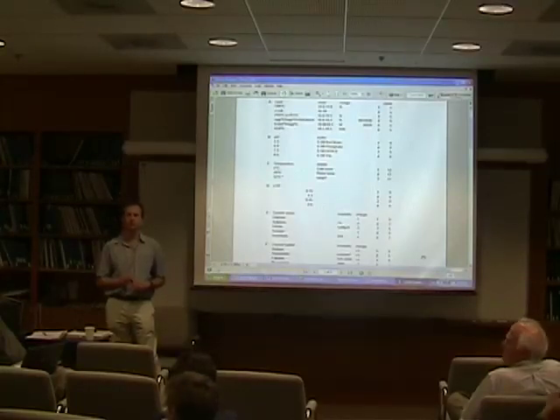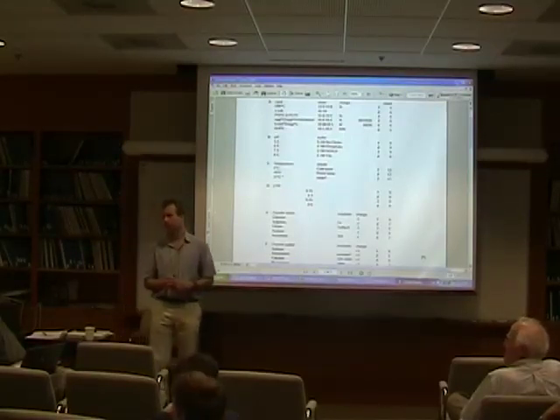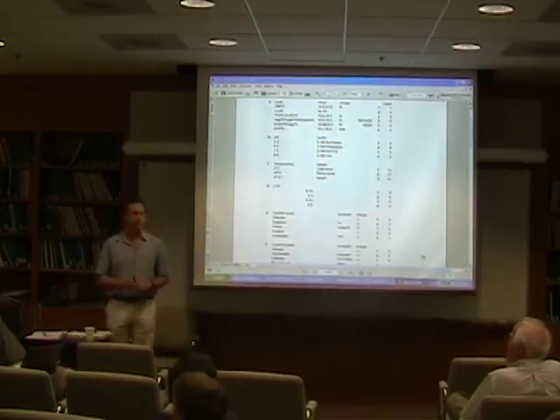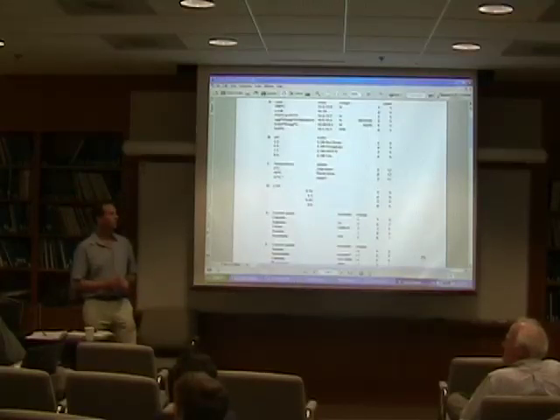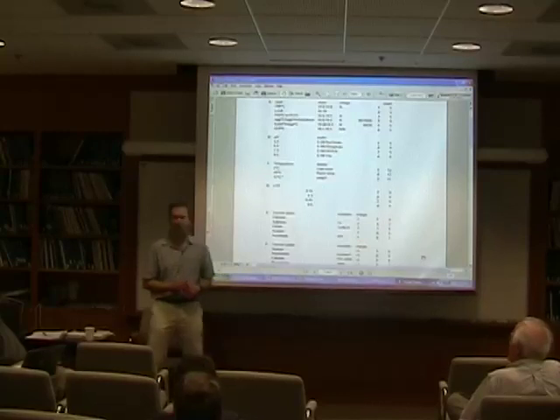Does anybody know of a 2D crystal that falls apart when you put it in a stain? I don't. But there are protein assemblies, like bacterial flagella, that will just be trying to stay with one stain. I think purple membrane will not diffract if you use uranyl acetate, and it loves PTA. It diffracts to very high resolution. Do we include that in the screen, or do we just say no, that's just something else? Okay.